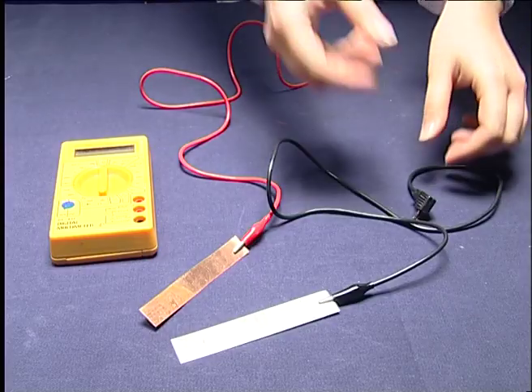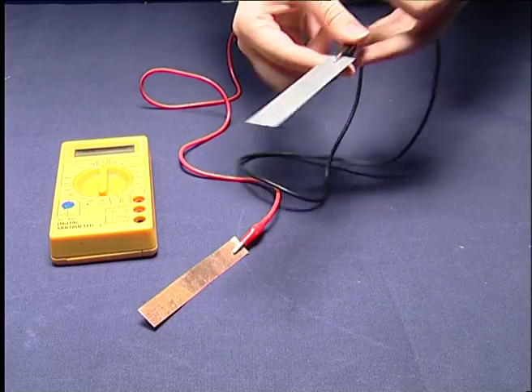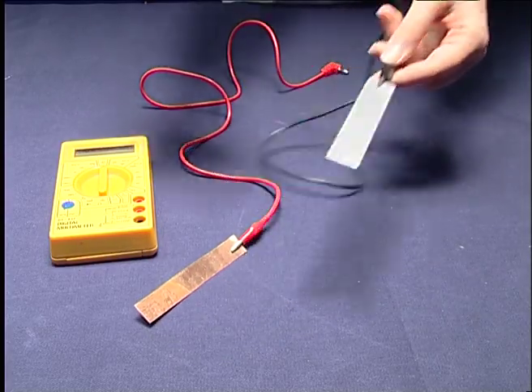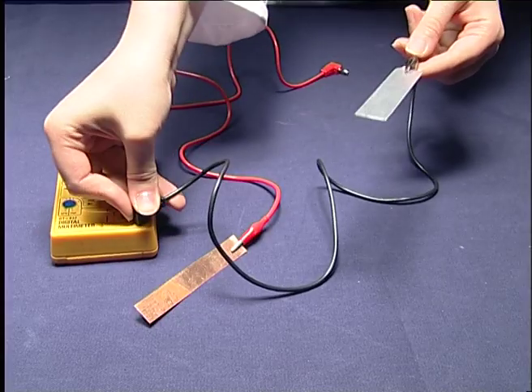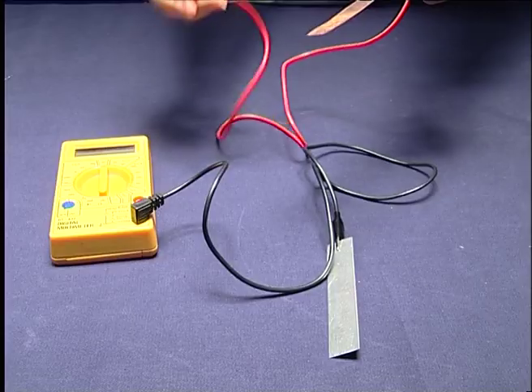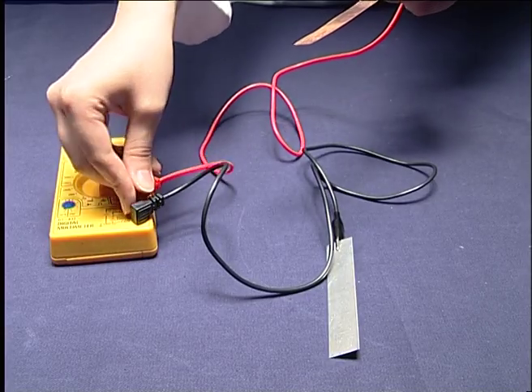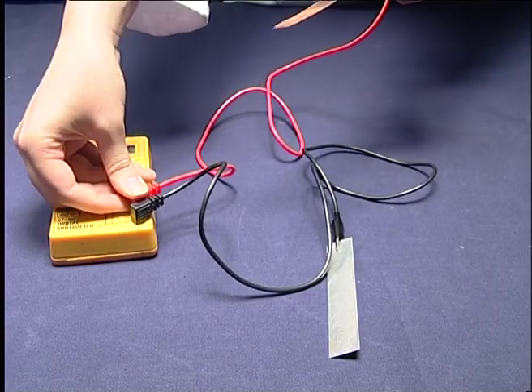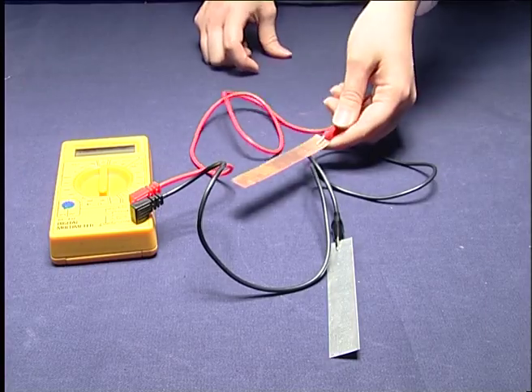Zinc electrode is connected with black wire and it is connected to the black side of multimeter. Copper electrode is connected with red wire and it is connected to the red side of multimeter which is voltmeter input.